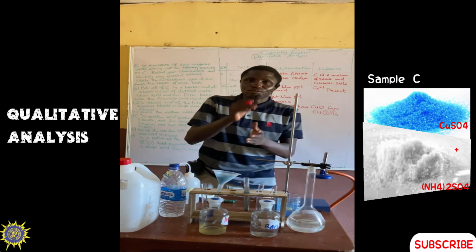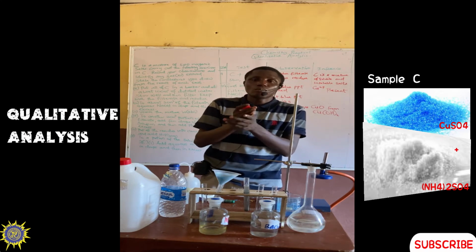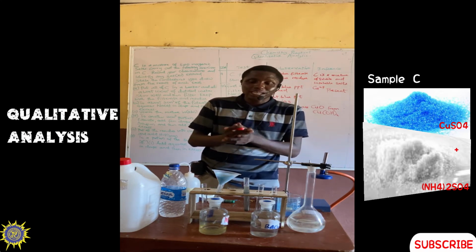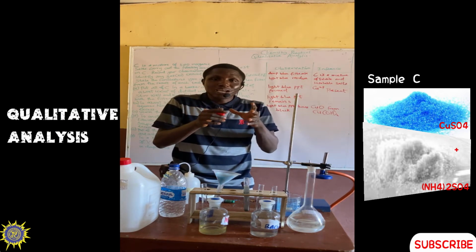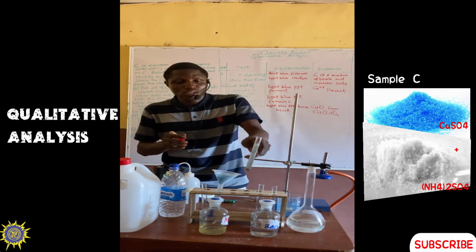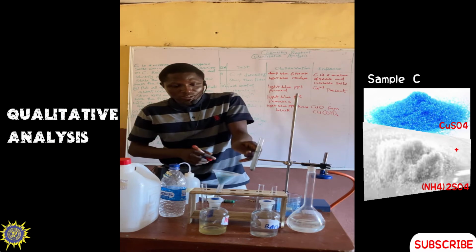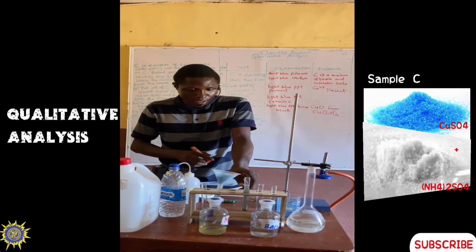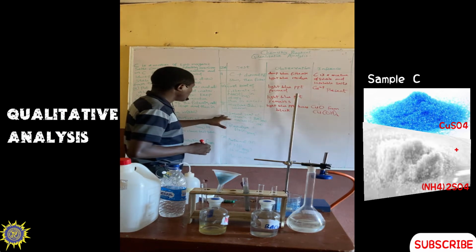So whenever you have a copper-containing compound changing from blue to black, it means that we only have the copper(II) oxide left in the solution. You can see now everything has become completely black. So that's that about question number 2. Now number 3.